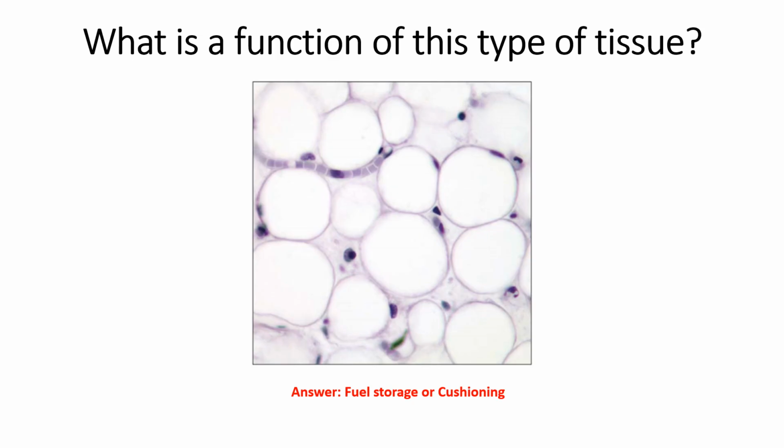So like one slide will just have the image and you can look at it and try to figure out what it is, and then the next slide will give you the answer, and then some of the slides will also help you practice and study functions of tissues, as well as identifying some basic common organs and thinking about what tissues predominantly make up those organs.